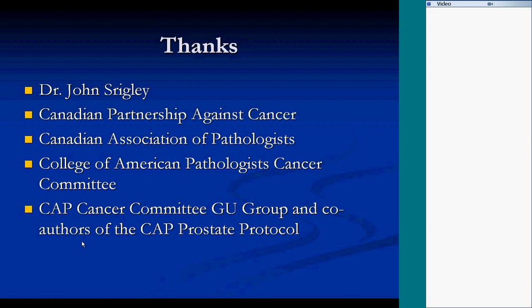On the other hand, I've seen cases where big wedges were taken, and those wedges included a lot of extraprostatic tissue and a substantial amount of margin. In those cases, you might want to consider it. But on a standard basis, we don't currently do that if we're confident that we haven't disrupted to a great degree the outer contour of the prostate.